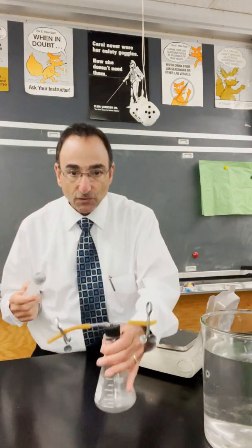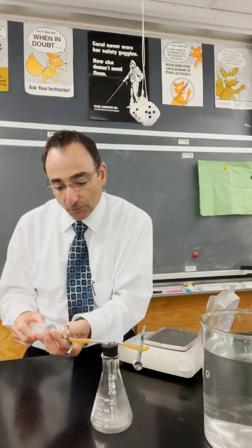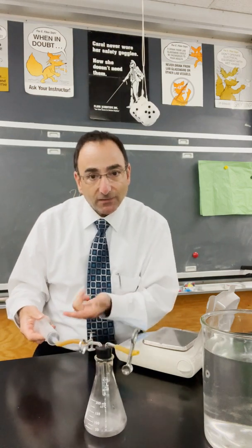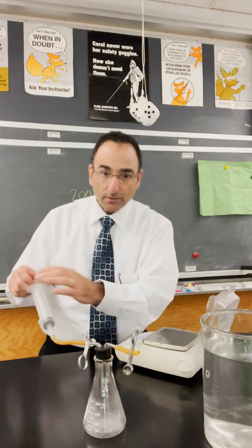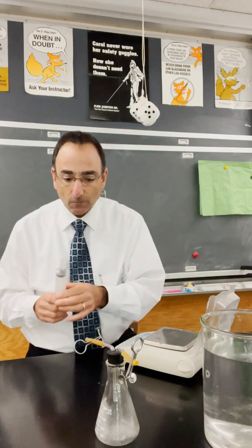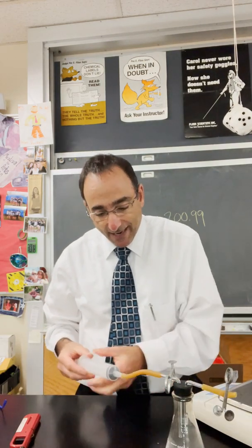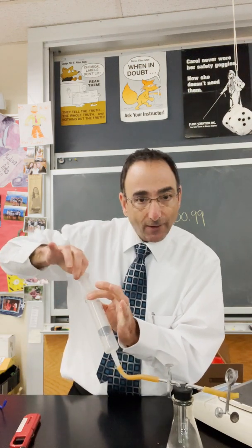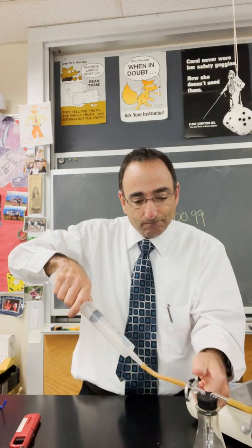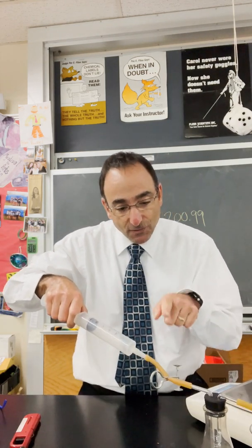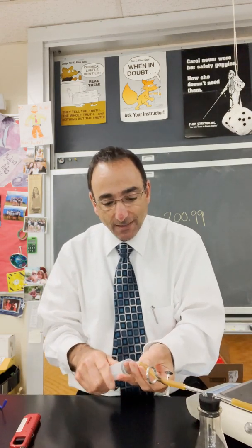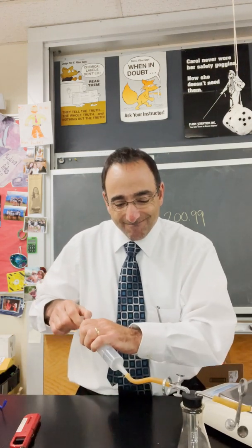To do that, we simply put the syringe on the rubber hose. Normally two partners do this, but I'm working alone so I'm going to pinch the clamp onto the glass tubing. One partner pulls and the other partner opens the clamp. I pull a syringe of gas out, close the clamp, and release the gas. Students need to pull six syringes out. By the second syringe they should start to see a vacuum forming — the syringe barrel will want to pull back in on its own, which is a nice discussion about air pressure. It's important that students never release the syringe without clamping first, or air will re-enter the flask.